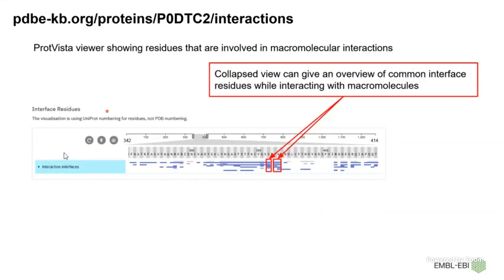If you collapse the interface interaction, you can see the overview of common interface residues which are involved in interacting with macromolecules in general.